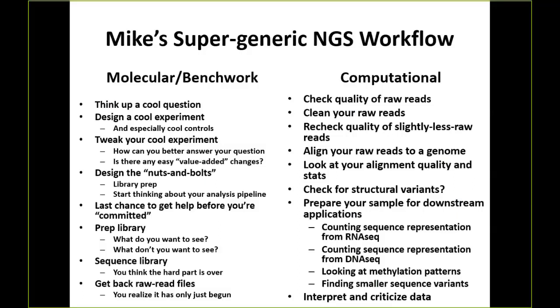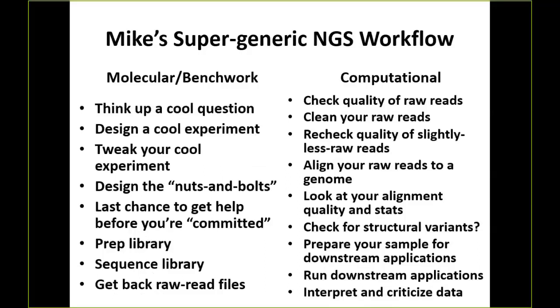All right, so as I mentioned, I'm assuming that just about every application is of interest to somebody in here. But pretty much for every application, you're going to get samples. You're going to generate reads. And to generate reads, you need to generate a library. So there's a whole sequencing step involved in the middle. And then once you get reads, you're going to have to get them back in a file format that's pretty standardized. And then you're going to probably align that to some kind of a reference genome. So we're going to start off by just walking through this pipeline.